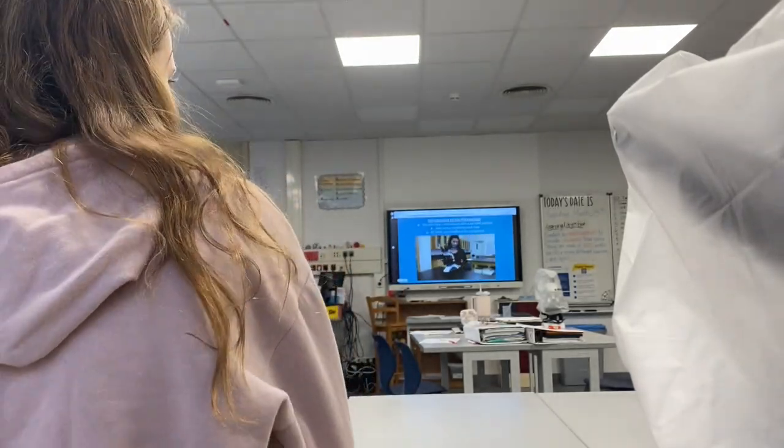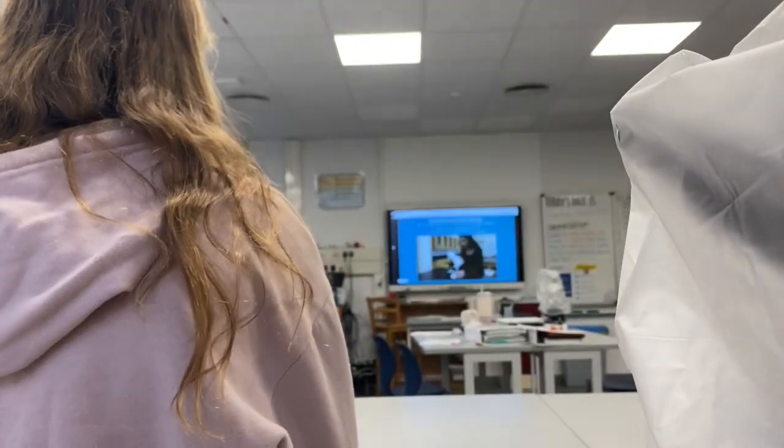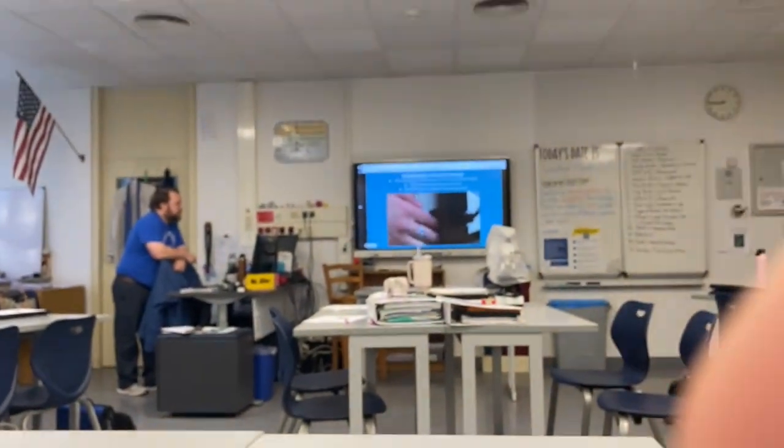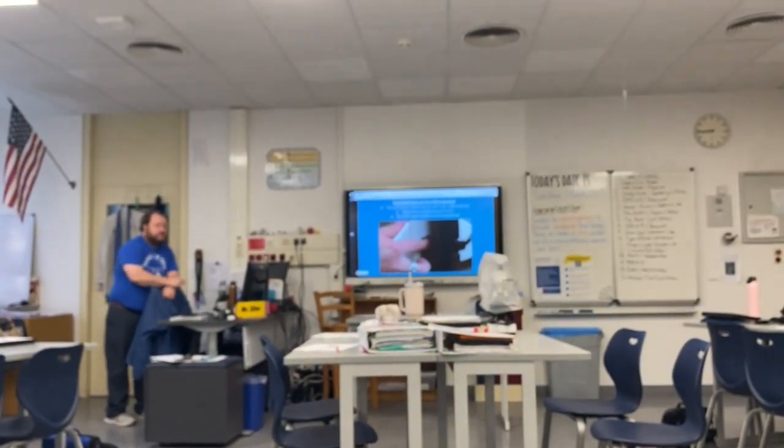Retrieve a microscope from the cabinet. Carry the microscope with both hands, one holding the arm and the other under the base of the instrument. If the microscope is too heavy for you to carry safely, ask for assistance. Unwind the cord from the back of the microscope and plug it in. The on-off switch is on the back of the scope and may be hard to find if the power cord is still wrapped around the holders.